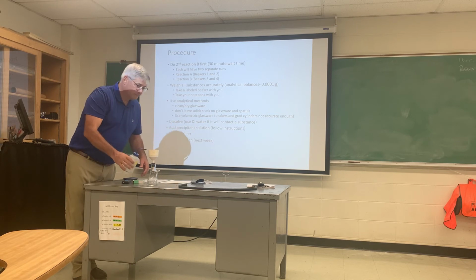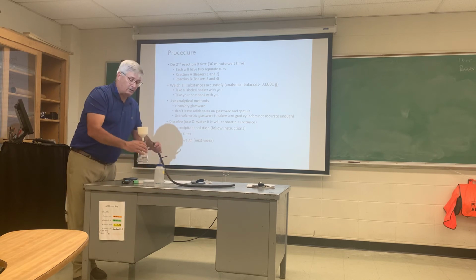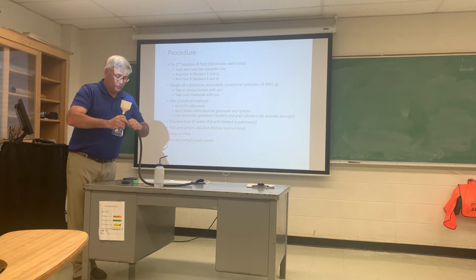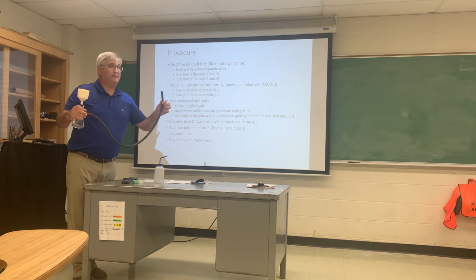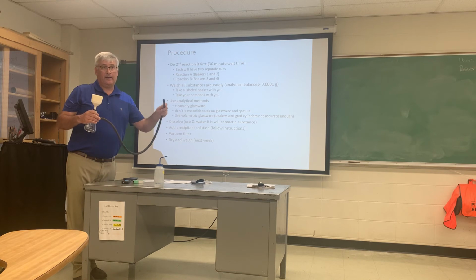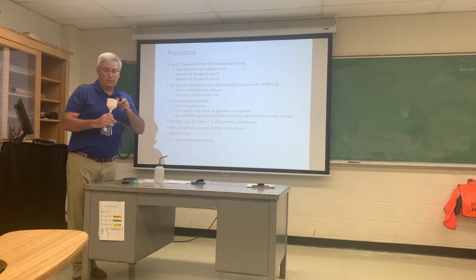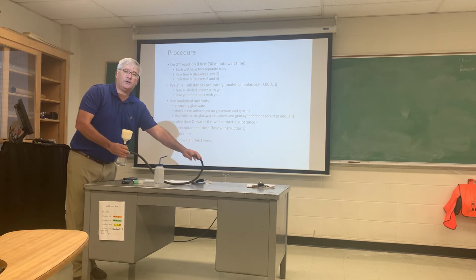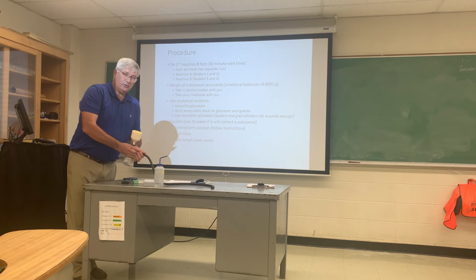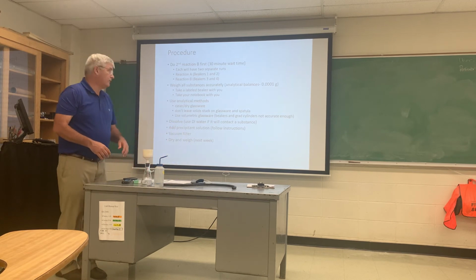Once you get it wetted, it will seat down tight on the funnel, and we're going to put a vacuum hose on it, and then hook it to the aspirators under the middle bench in that sink. There are some aspirators that will pull a vacuum, and so we'll do a vacuum assisted filtration for all of our solids. So you'll do 4 filtrations today using a Buchner funnel.